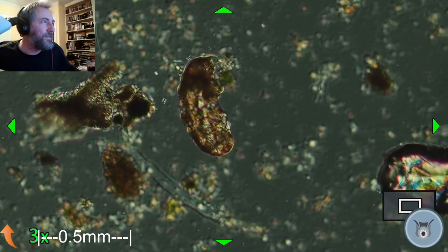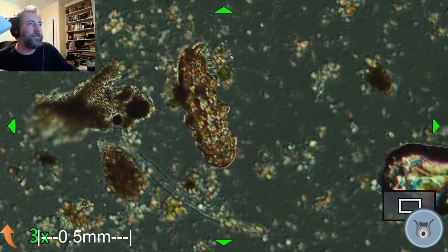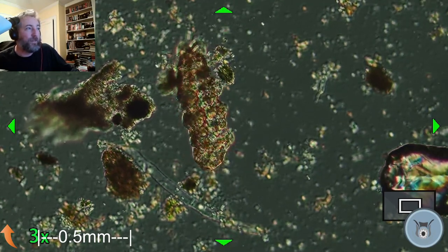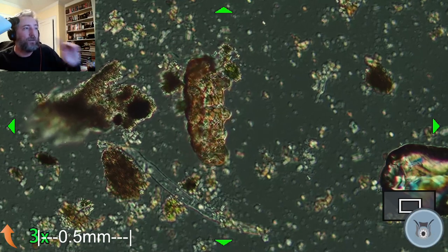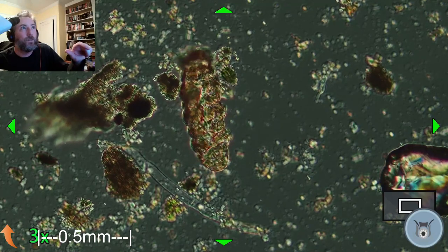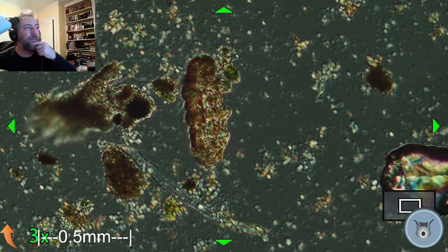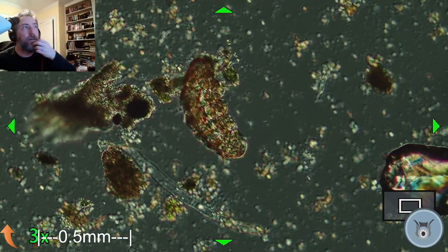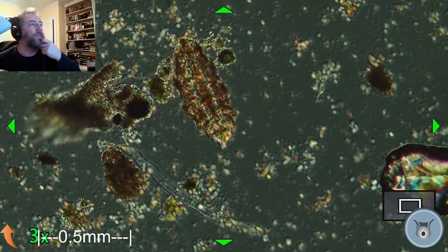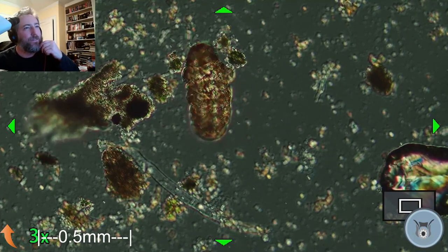Do these creatures live everywhere in the world? Water bears can be found in most places. I know that they've found them in Antarctica. And so I would think that they range everywhere from Antarctica to the Arctic. And they're found at the top of the Himalayas, and they've been found in, like, the deserts of the Southwest. So I'm not sure if they're absolutely everywhere, but they're probably most places.